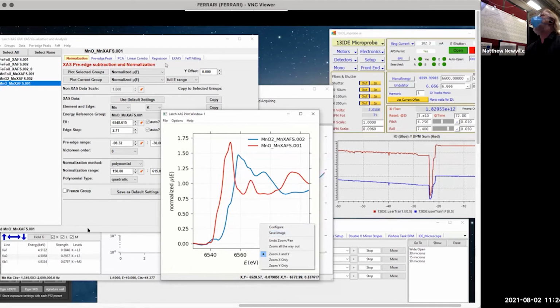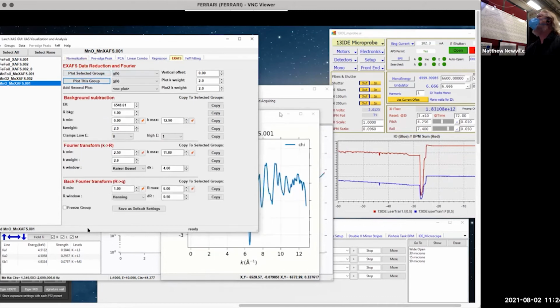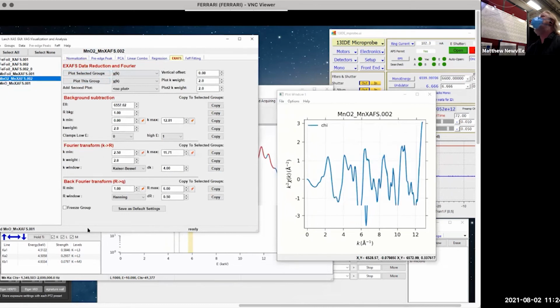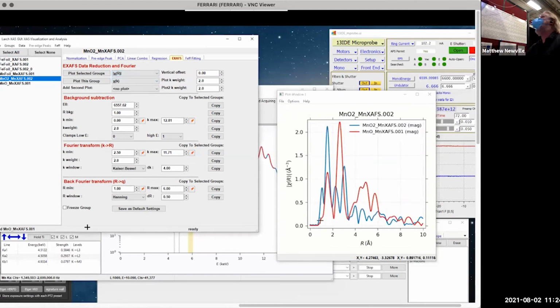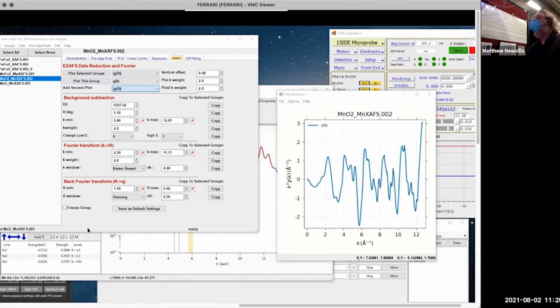And I think for that MnO, we're going to get the XAFS. Yeah, so that's the XAFS for MnO. For MnO2, that's the XAFS there. So we plot those two together. Those are the two different XAFS. I haven't played around with trying to get the background subtraction, the high k stuff, a little, but those are decent. Let's look at the chi of R for those two. I think there's a little bit of background subtraction we would want to fix up for the MnO2, but it's basically right. And we see that in fact the intensities are about the same, just the peak positions are different. So for the MnO2, we see the very tight oxygen bond. Okay, let's plot the two chi of R over here.